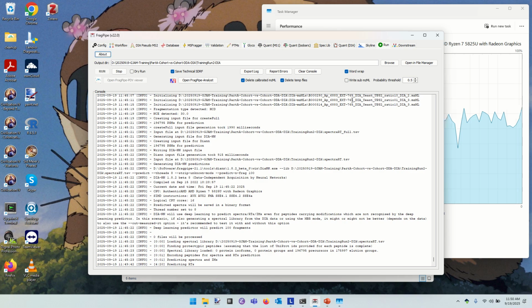What is the cost in the end? If the software claims some protein is present, but all these peptides are actually false positives, why is it problematic to have that in a spectral library used for quantification?